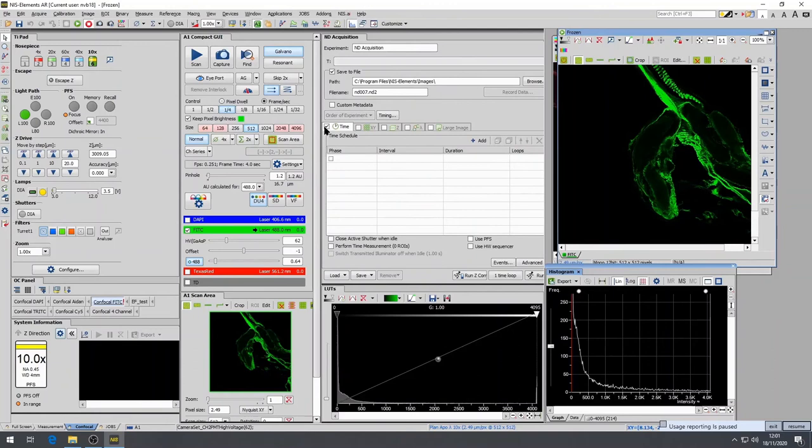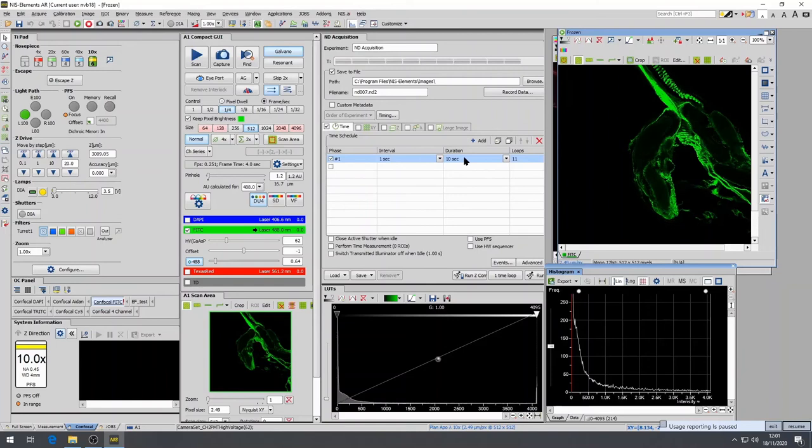Time-lapse imaging is extremely useful for the observation of cellular and subcellular kinetics. The parameters found within the time tab allow for significant control over the acquisition rate. The tab is broken down into four sections: phase, interval, duration, and loops.